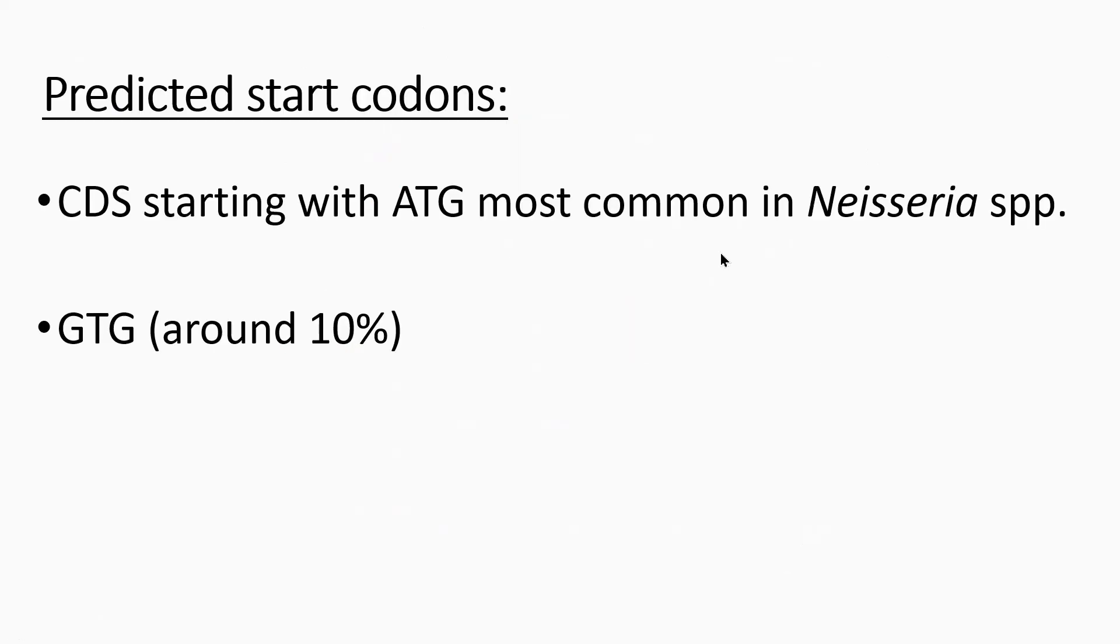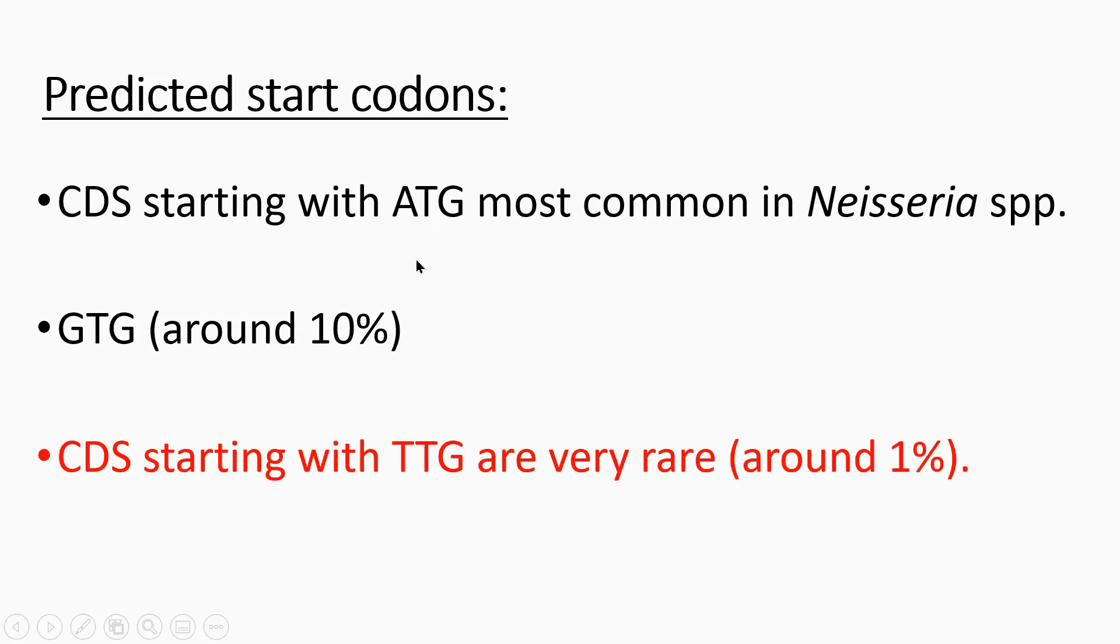It's interesting because the most common start codon in Neisseria, which is what I was looking at, ATG is the most common start codon. GTG is present in around 10% of genes and TTG are very rare, around 1%.